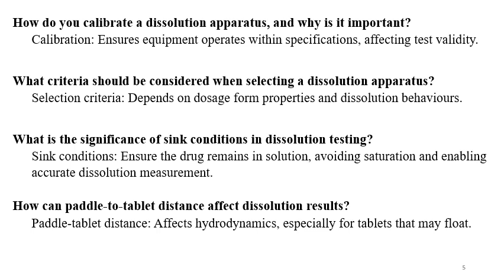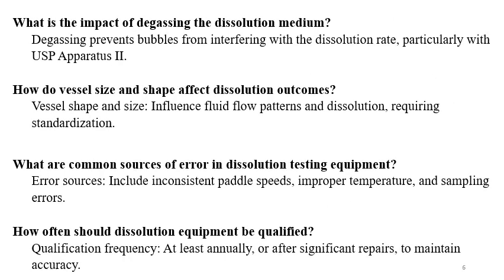Paddle to tablet distance affects hydrodynamics, and that's why it affects the dissolution, because the tablets may float. What is the impact of degassing the dissolution medium? Degassing prevents bubbles from interfering with the dissolution rate, particularly with the USP apparatus 2.